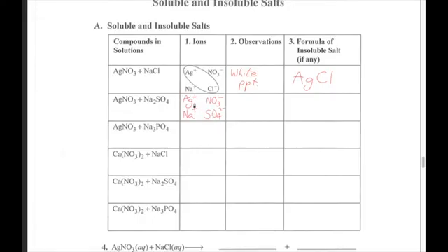So go back to that video and see whether you had a precipitate or not. We want to write down this observation here. If you have gone back to the video and come back here, or just remember, we had a white precipitate as well when we mixed together our silver nitrate and sodium sulfate. So that white precipitate that we see must have been our silver sulfate.